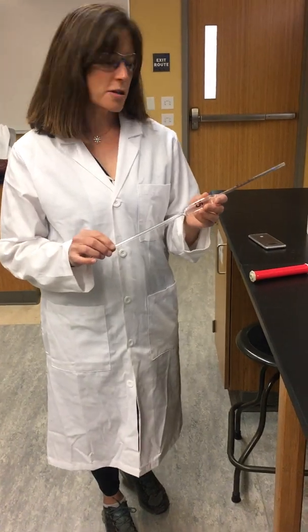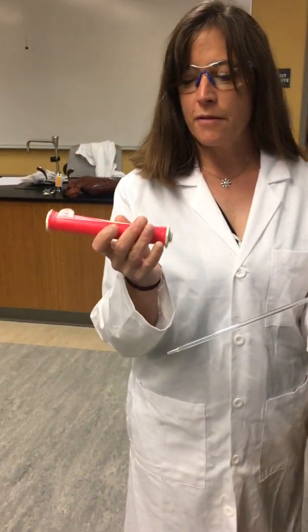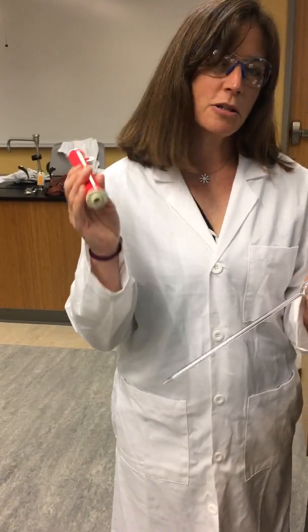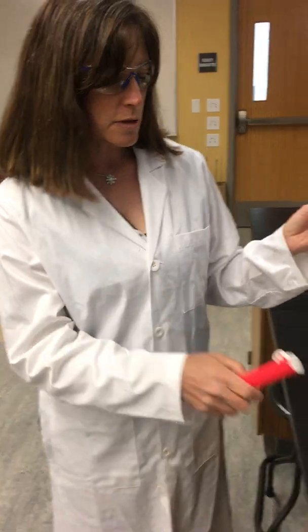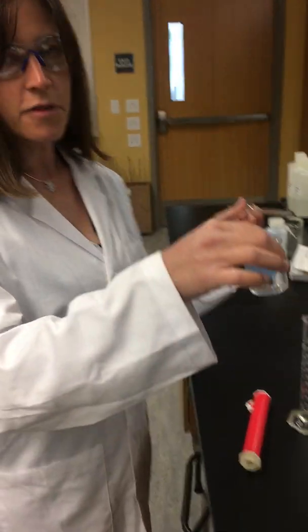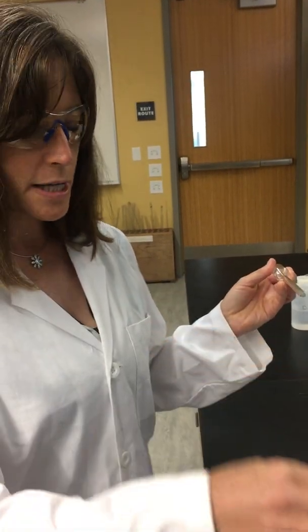So when using a volumetric pipette, you need an apparatus. We have what's called a pipette aid. We can use pipette bulbs, but they do the same thing. We already have our volume of liquid, which in this case is water, poured in a beaker.